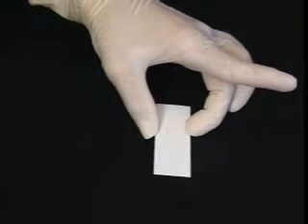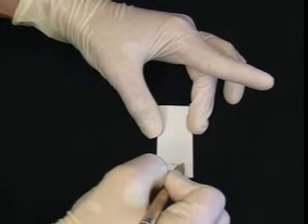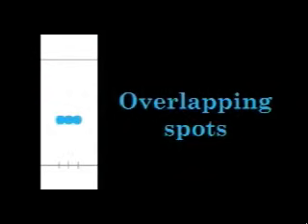Before you can apply your sample to a TLC plate, it is important to mark the plate so that you can keep track of where the sample is applied. One way to do this is to draw a straight line approximately one centimeter from the bottom of the plate. Draw small ticks through the line at each point where you will apply a spot of sample. It is important that the spots are not too close to the edge of the plate, or evaporation from the sides will result in inconsistent results. It is also important that the spots are not too close together, or you will end up with overlapping spots after you develop the plate.